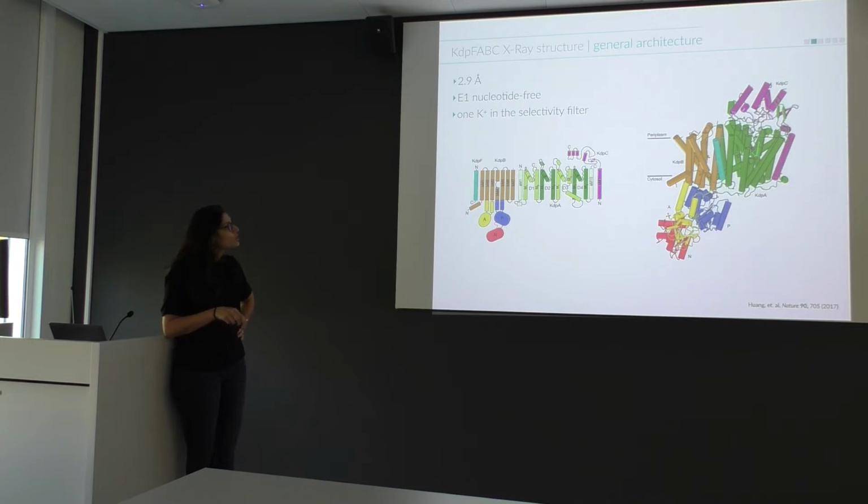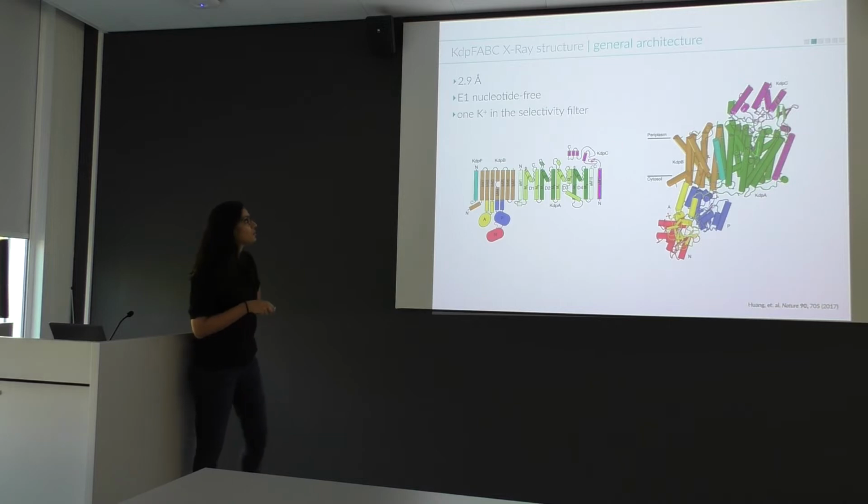So this was in 2017, when I started working on it, or actually had already started working on it in Zurich. There was an X-ray structure solved, which then also revealed the general architecture, because before that it was just a couple of assumptions. It is at 2.9 angstrom resolution, probably in an E1 nucleotide-free state, and at the selectivity filter, here they even saw a potassium bound.